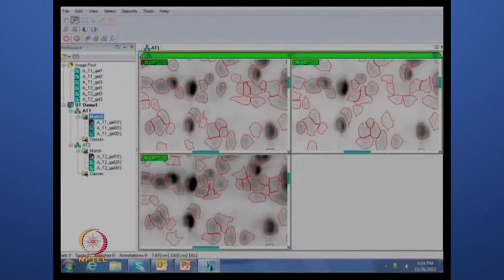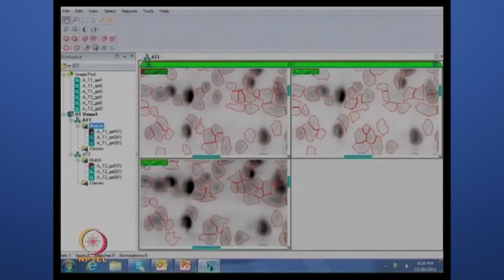I think the parameters are very well defined, because it has properly defined the boundaries. And there are some spots where one can now tweak around. Exactly, if you want to edit these particular spots. You can see there is, I think you can't see a protein, but it is showing as a protein. One can delete this kind of spots also. One should go to edit the spot; there is an option like edit enable. Go there and just delete the spot.